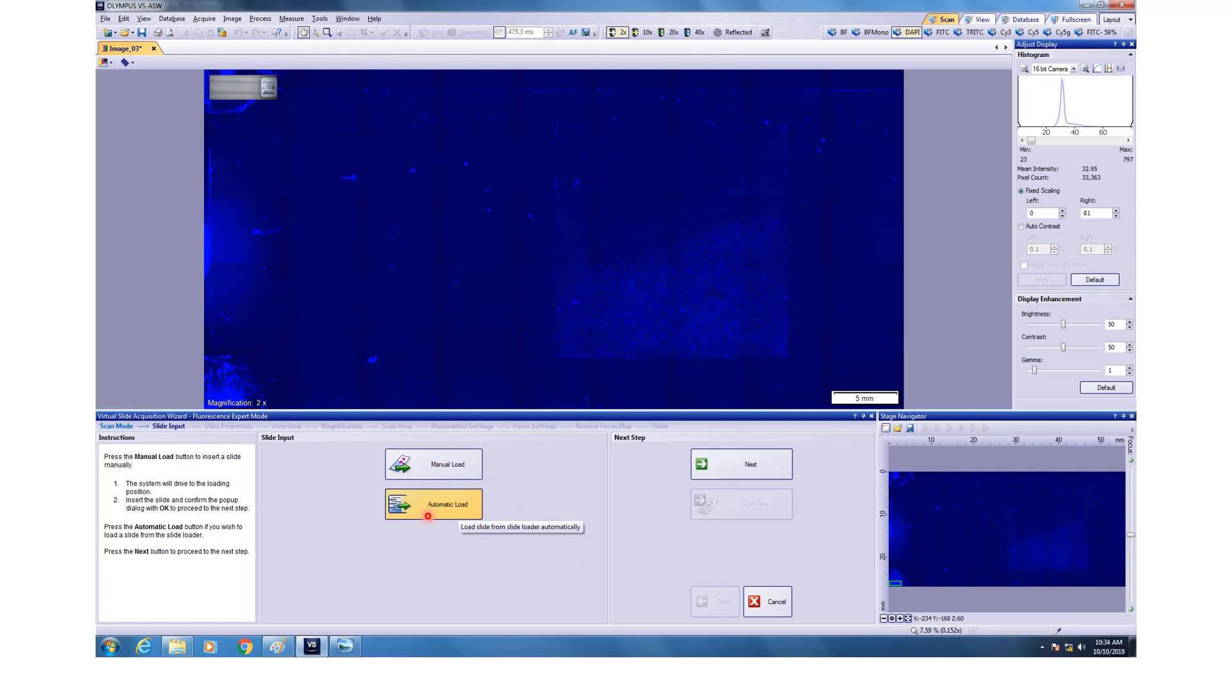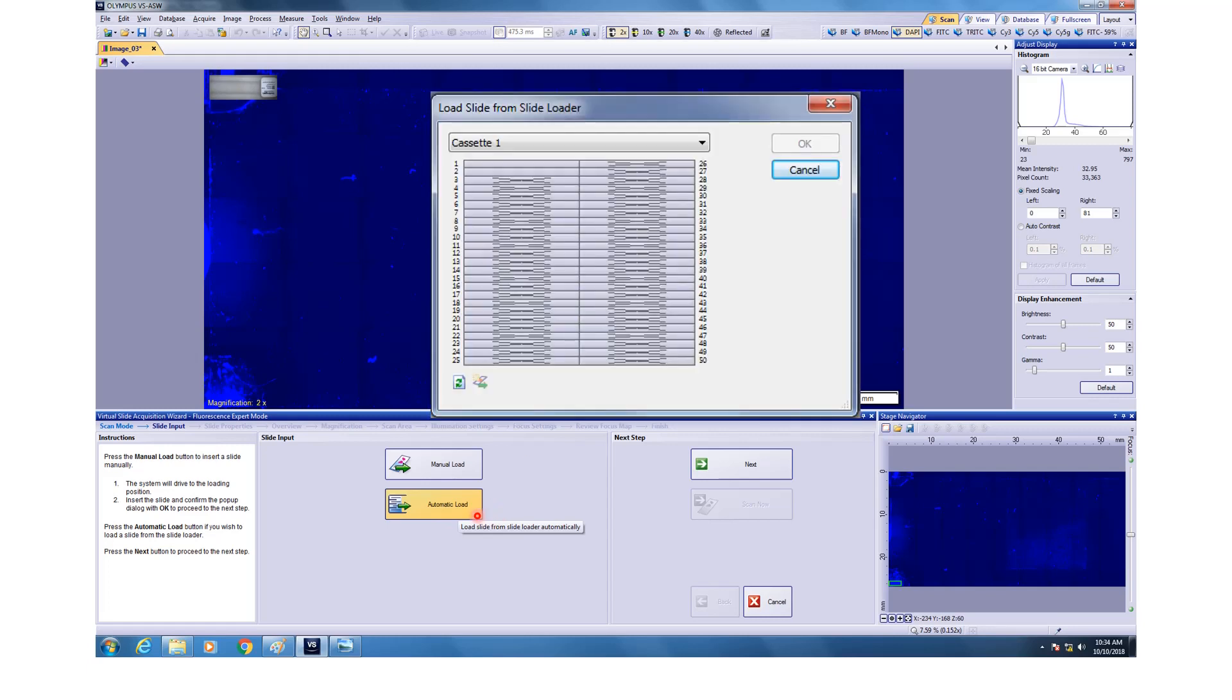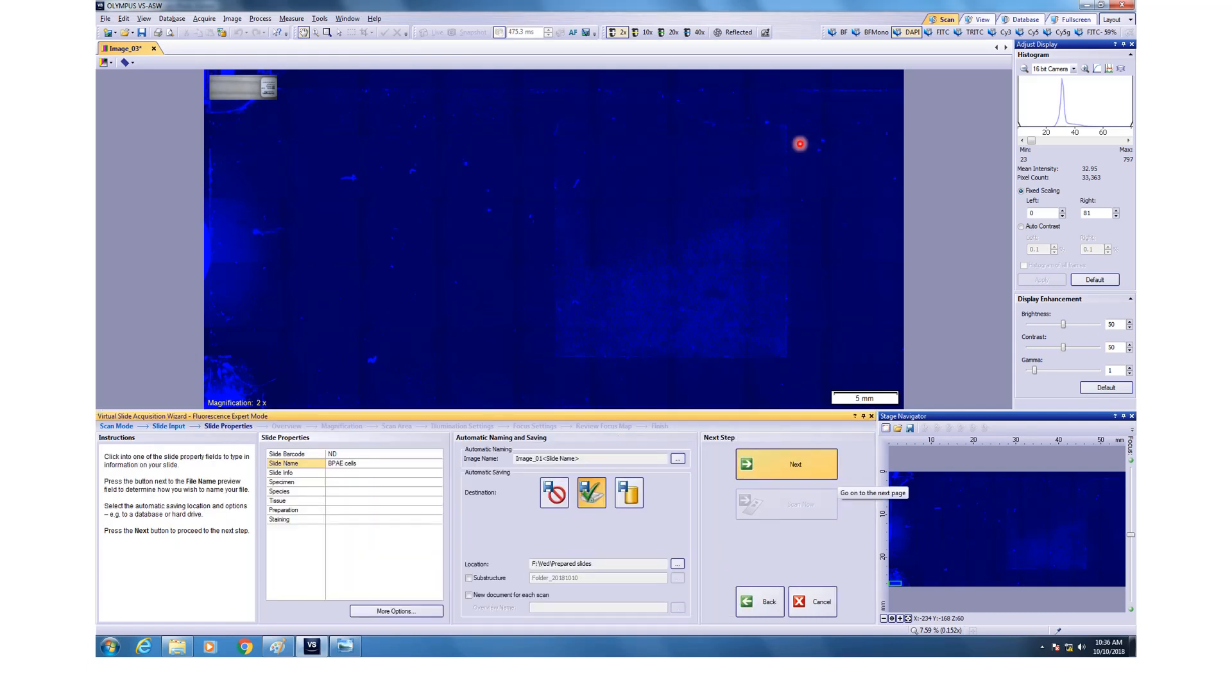Usually the space will be blank. I have this thing here shown because I tried some imaging before. If you click automatic imaging, then it will again ask you for loading the slides. You click OK. After that you will be asked to fill in the details about the slides. You select the saving location and everything and you can put in the names and then you click next.